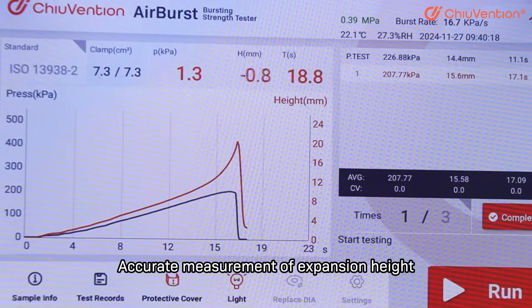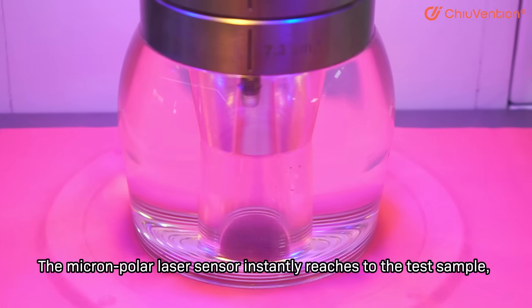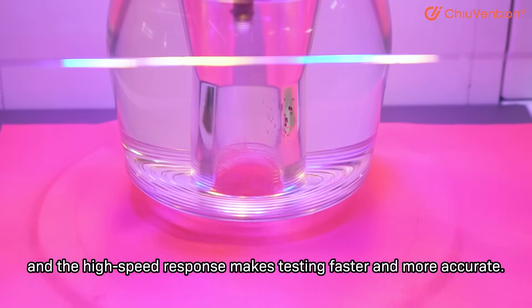For accurate measurement of expansion height, the Micron Polar Laser Sensor goes right to the test sample, and the high-speed response makes testing faster and more accurate.